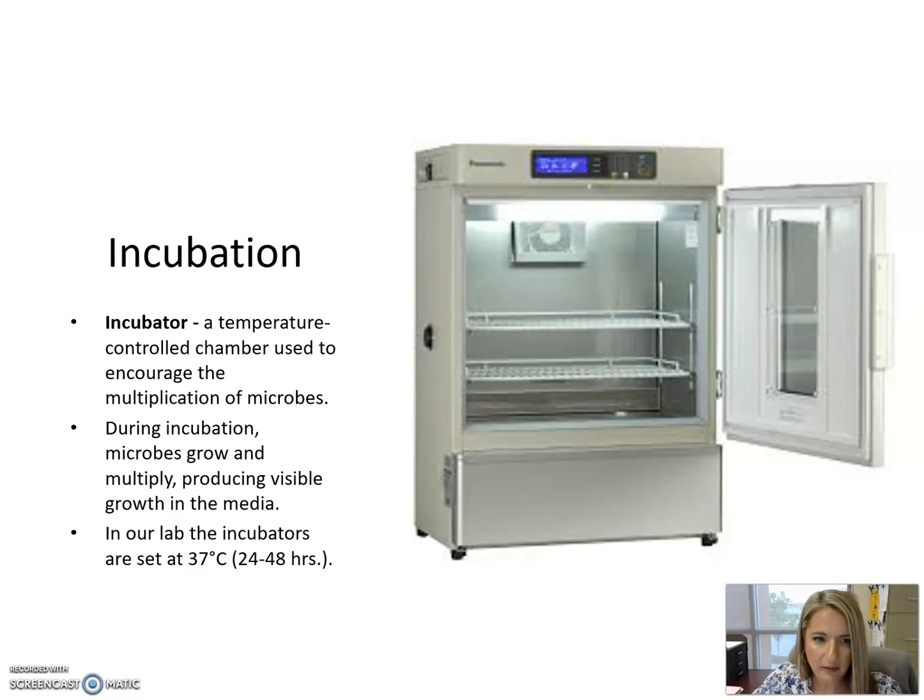So the next of the 5 I's is incubation. Once you've done your inoculation and you've put the sample into the media so that it can grow, you'll want to put it in the incubator. And the incubator is basically this temperature controlled chamber that is going to encourage the growth of microorganisms.